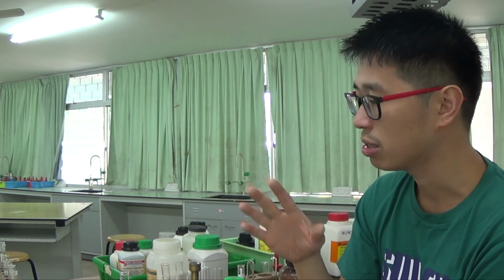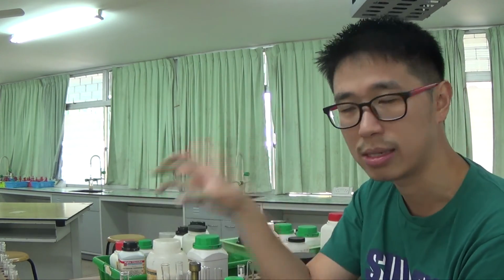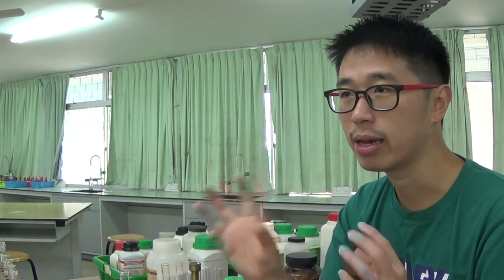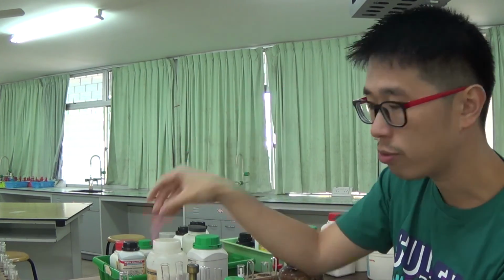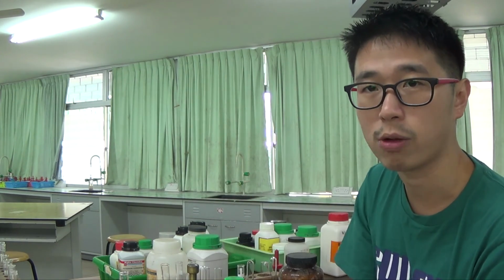And towards the end, I also test for the colored cations, the cations that come from colored species: iron 2 and iron 3. It's very hard to see any white precipitate against the colored precipitate background, but for ammonium ions, in the presence of excess sodium hydroxide, we can heat it, and then we test with moist or damp red litmus paper. That will confirm the identity of the ammonia gas, which will then confirm that ammonium ion, NH4+, was present in the original solid, which is present as a mixture. Double salt is a mixture.